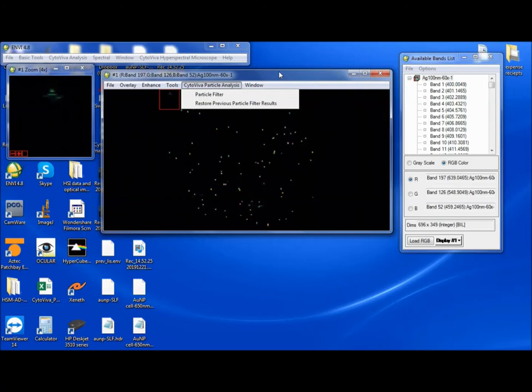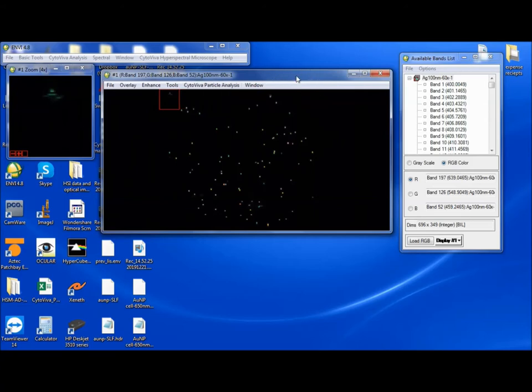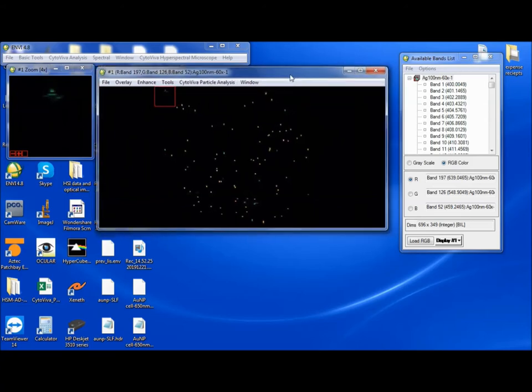It will also show you the maximum mean intensity and the maximum and mean spectra of that particle. This can be very useful not just for counting particles, but for also finding out information about your particles, such as distribution of peak wavelengths and intensity, even seeing if there's some kind of relationship between intensity and wavelength. I have a data cube open of some 100 nanometer silver, and we see the particles are pretty evenly distributed in this center area.